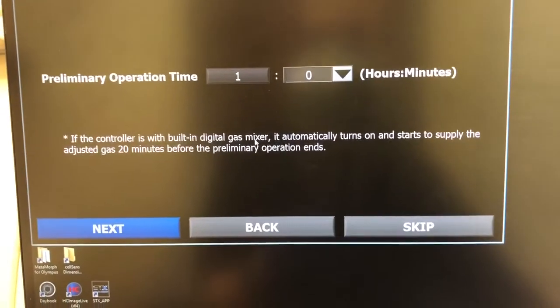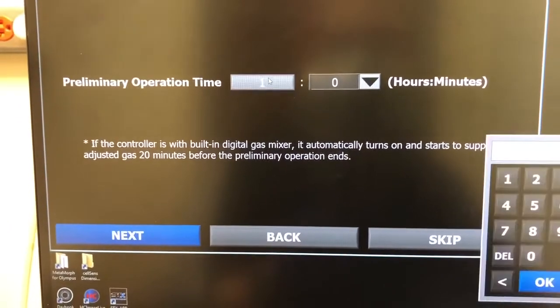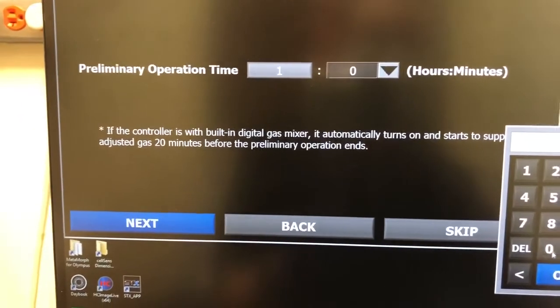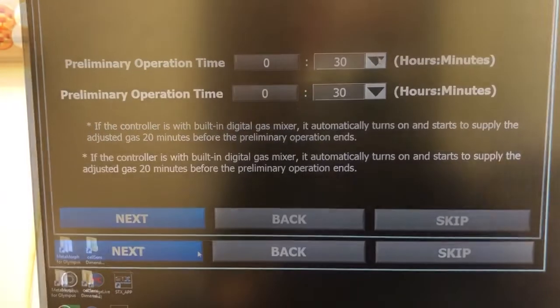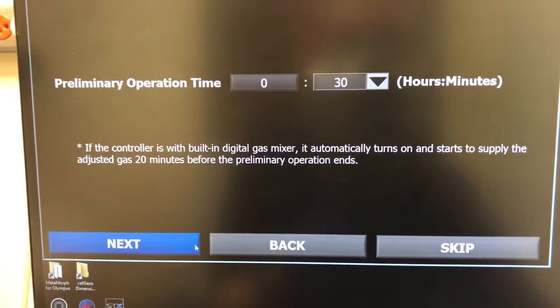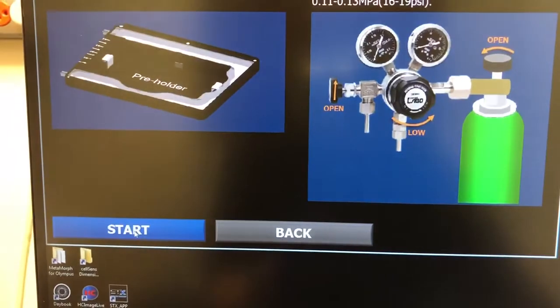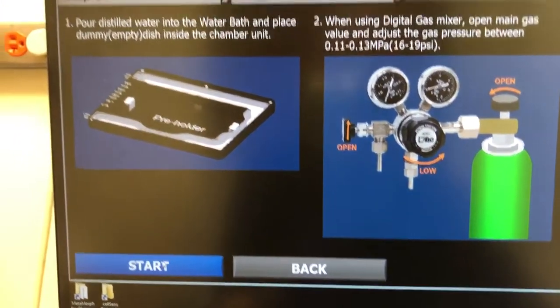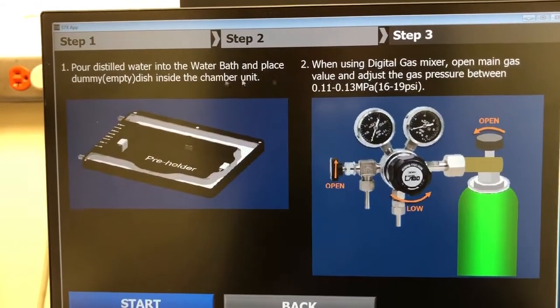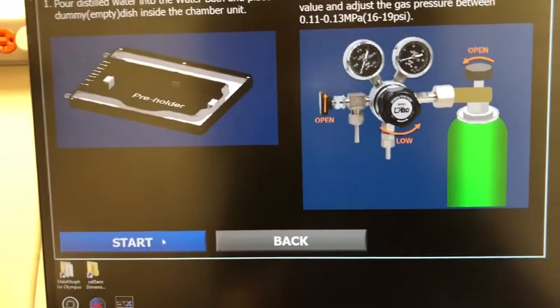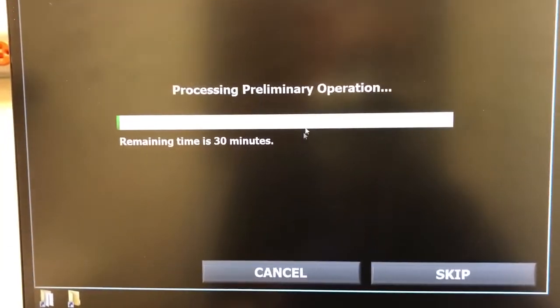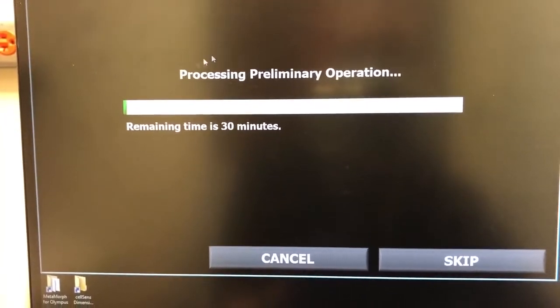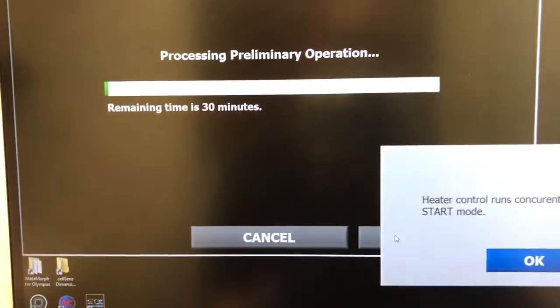So this is the preliminary operation time. You can just set this to zero. And the minimum preliminary operation time will be 30 minutes. We've already done this. We've poured distilled water. We have the gas mixer at the proper pressure. And so here, instead of trying to equilibrate, we can just skip this step.